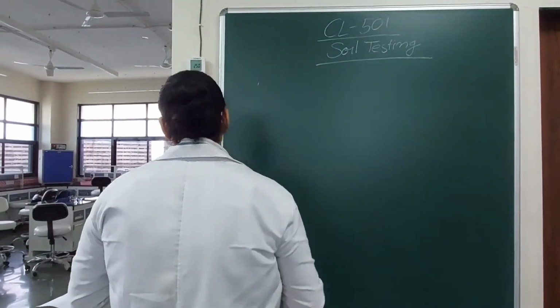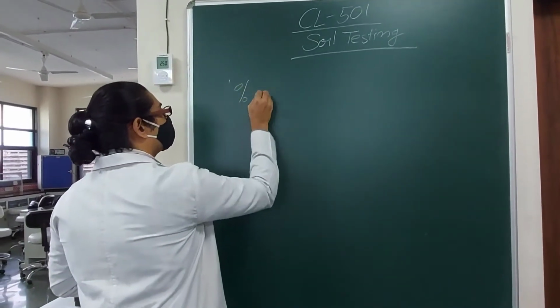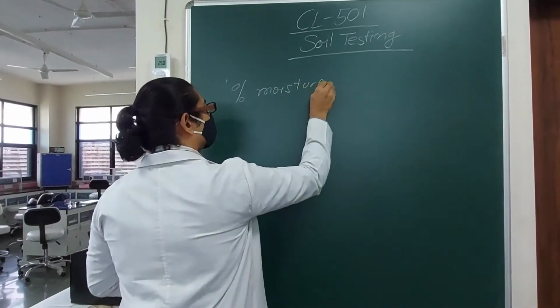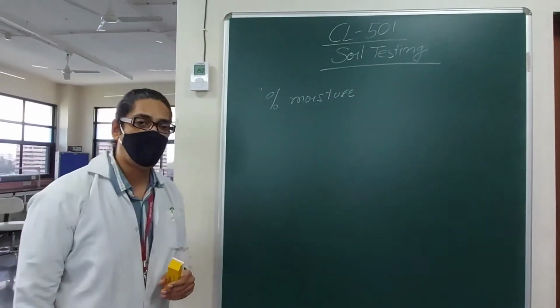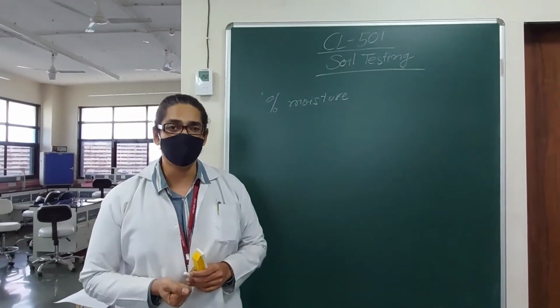The next parameter we have to measure is the percentage moisture. As I said, it is the ability of the soil to retain water.